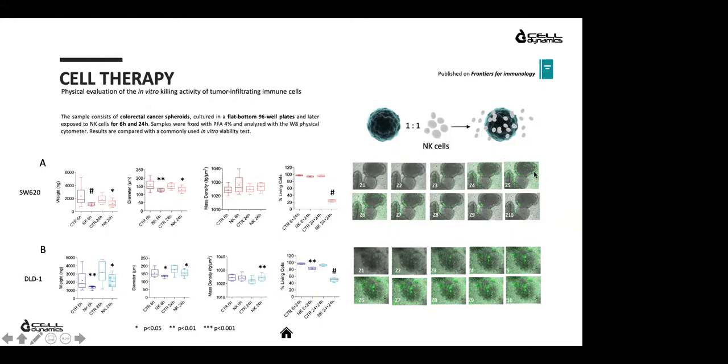So this different infiltration rate may explain the differences in mass density that we detected with our flow-based device. And this can be useful because it can open up the study of different modes of action of NK cells to attack and destroy the tumor, depending on the cell type composition of the spheroid, but also depending on the physical properties of the spheroid as well.